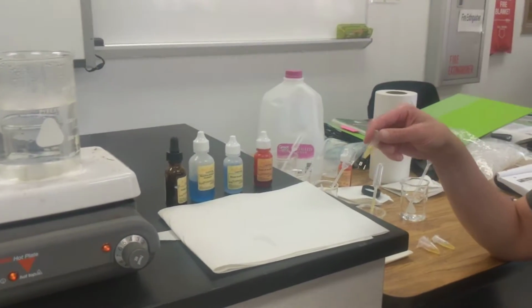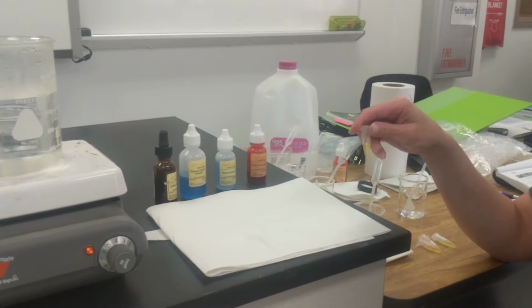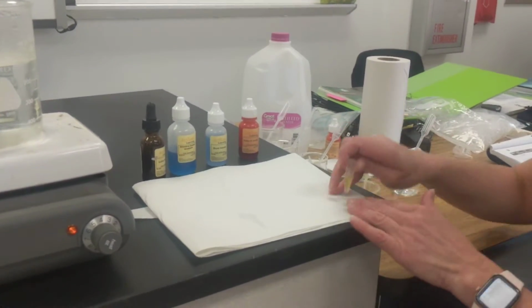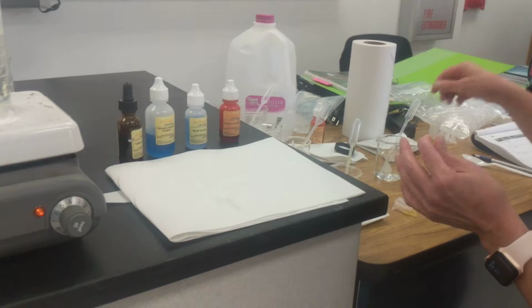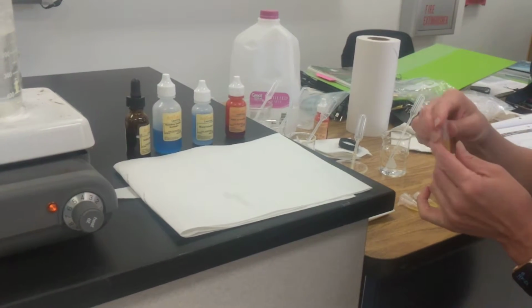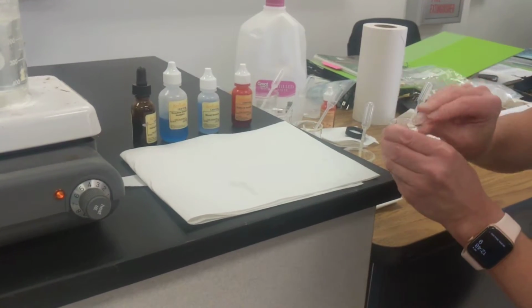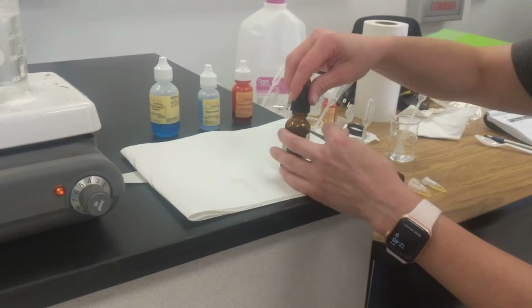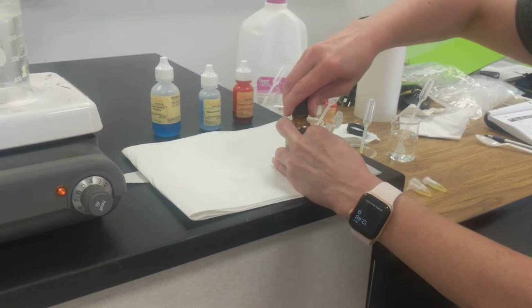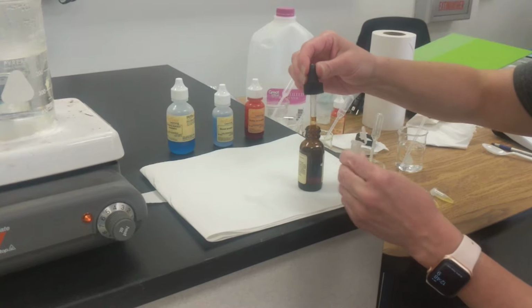Okay, all right, so here's our butter in the vials. It's kind of a yellowish color. I think most of us have experienced butter probably melted in some sort of way. So that's what I needed to do with that so that I could test it, is to melt it. So I'm going to go ahead and open this vial. We've all done our predictions, right? I'm hoping, because now we're watching this.